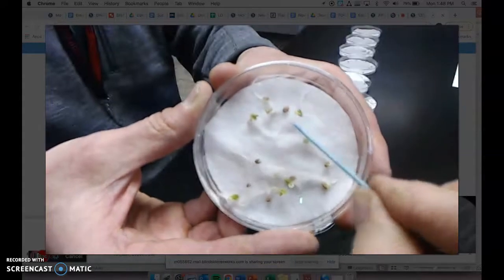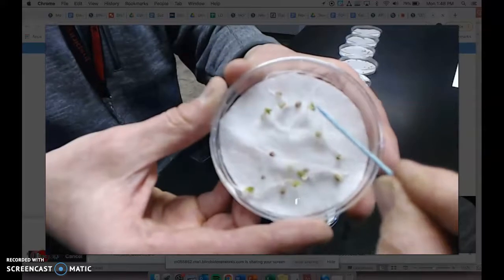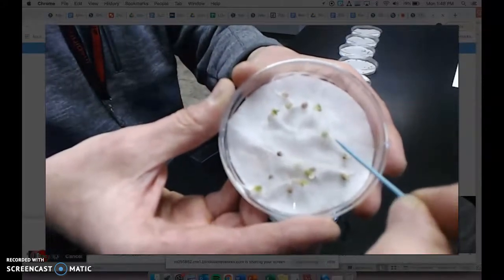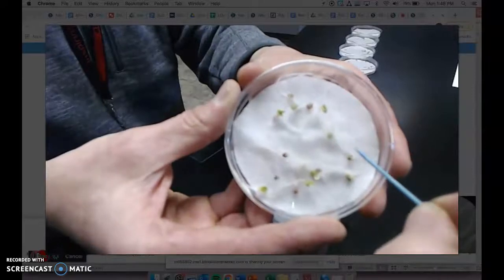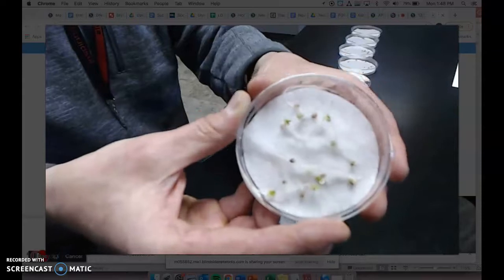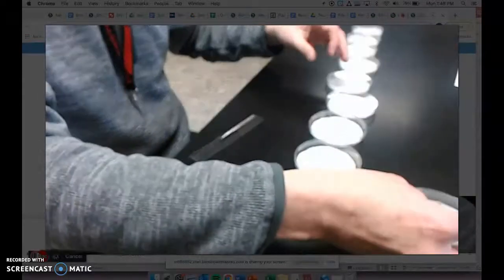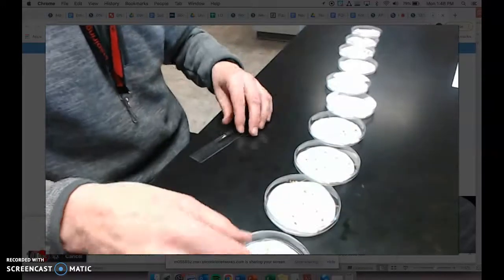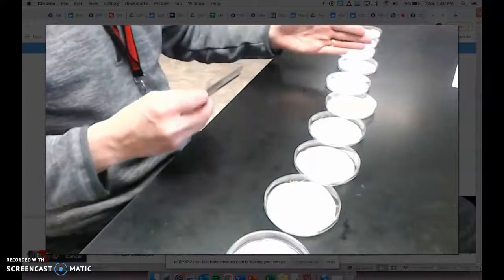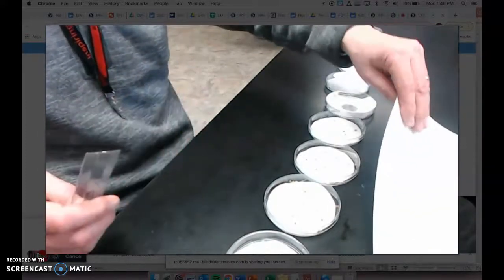This is a dicot, so this would be two dicotyledonate, but that's going to start absorbing energy now. The seed had energy to start to grow, to anchor itself and get its root hairs down to absorb moisture, but if it doesn't start opening up some green leaves quick, it's going to run out of energy. So we have a pretty clear cutoff down in here as to where the seeds started dying, and you'll see that in our data table.